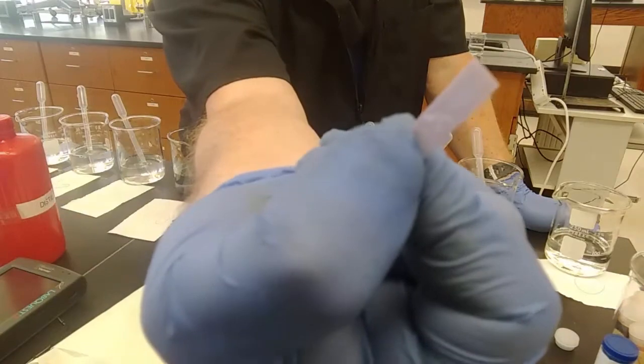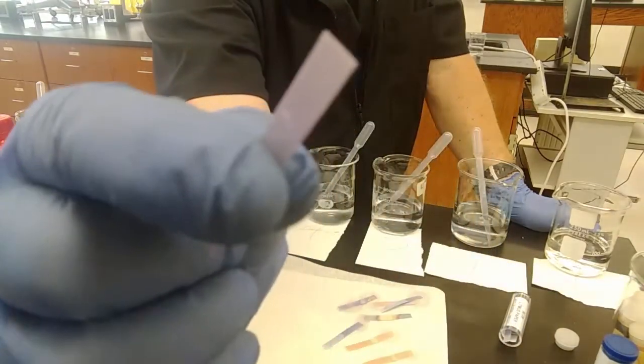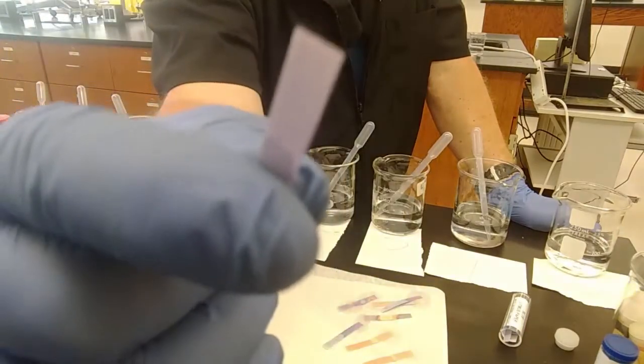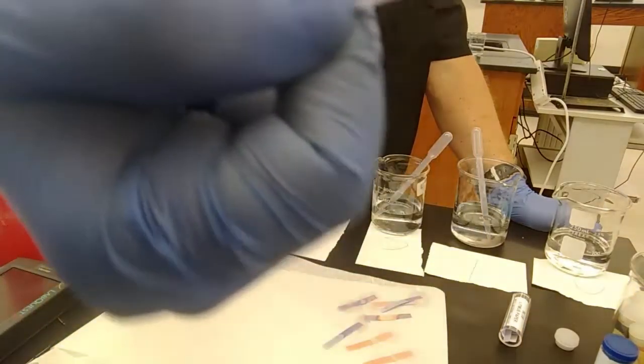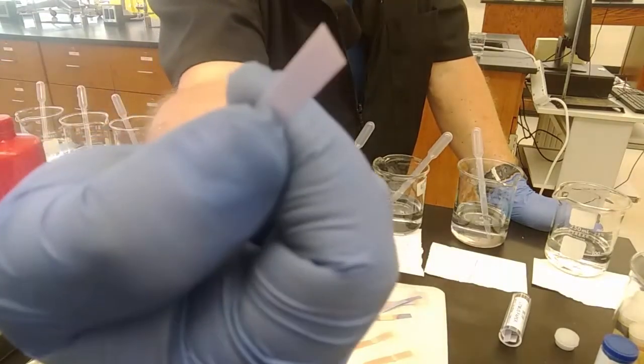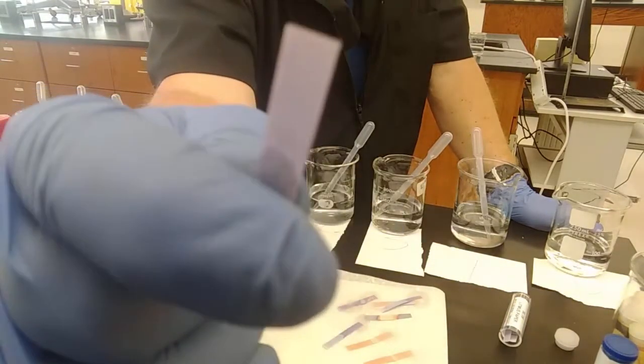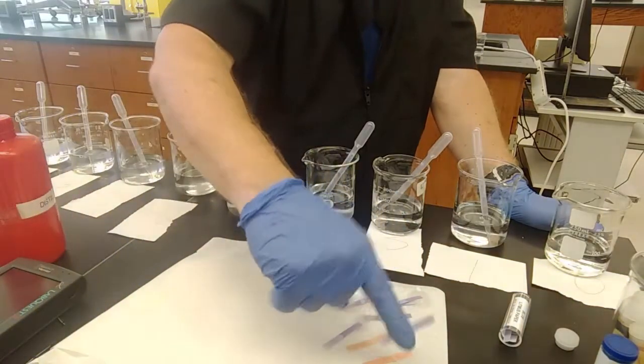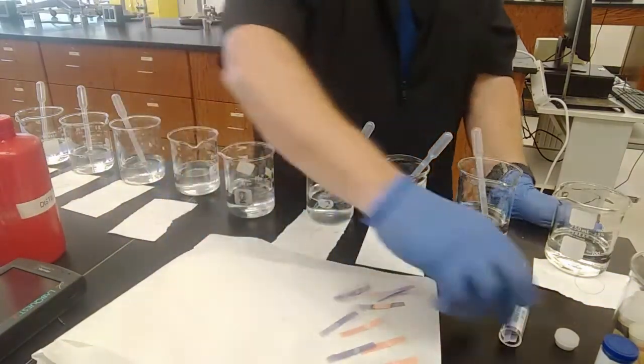See a little bit of red there, but not dramatic. This would not raise warning signs to me that, hey, you've got an acid when you're expecting pH 10. This is looking like it's just staying blue, maybe turning a little bit pink. It's hard to say. So, not the most useful test.